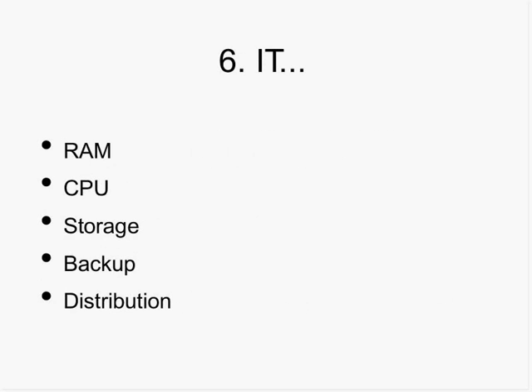IT considerations. Even before you start thinking about how to assemble this thing, you've got to think about how much RAM do I need in my computer, how much CPU do I need, what am I going to do about storage, what am I going to do about backup in case something catastrophic happens, and how am I going to distribute all this data to other people? Am I going to distribute it through just this little pipe that comes out of my lab or my university and then people are going to take days to download, or am I going to upload it to the cloud where everybody has access to it?